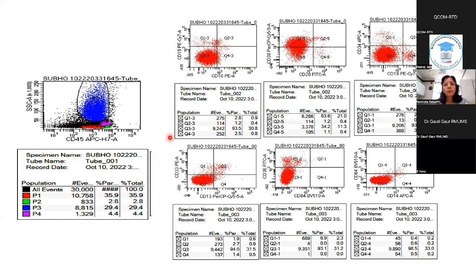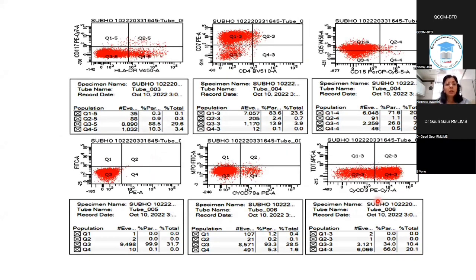Now these blasts, looking at their immunophenotype, they are negative for 19 and 10, negative for 20, some express 38. They are negative for 34, negative for 13 and 33, the myeloid markers, and negative for 64, 36, and 14, which are again the monocytic markers. The blasts do not significantly express HLA-DR, but they are expressing CD7, CD5, and cytoplasmic CD3, but cytoplasmic CD79a and MPO are negative.